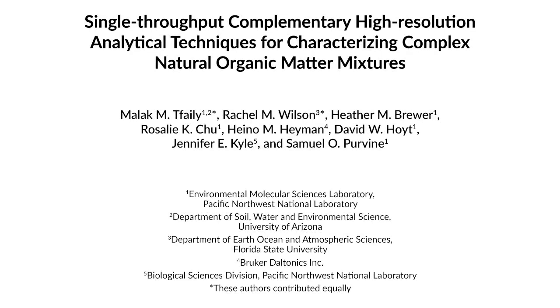This protocol describes a method for comprehensive, unbiased molecular characterization of a single sample using both mass spectrometry, using metabolomics, proteomics, and lipidomics, and nuclear magnetic resonance spectroscopy platforms. The significance of this approach is that we can characterize a biological system downstream of the genome through identifying different types of molecules, allowing us to infer metabolic and decomposition pathways.